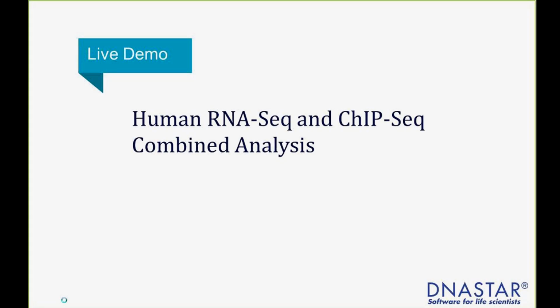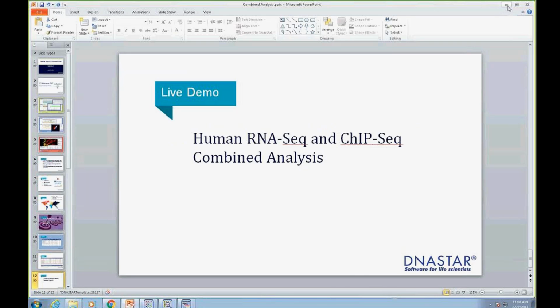Today we're going to focus on looking at gene expression, RPKM calculated gene expression with peaks, and use some of the nice new visualization to show how we can very easily take very large data sets and combine them. So at this point, I'll jump out of our PowerPoint and we'll go into some software here.